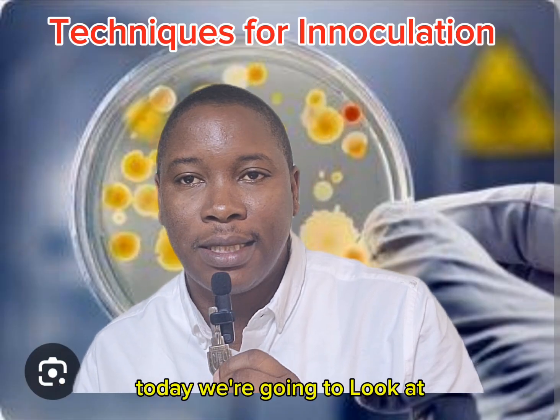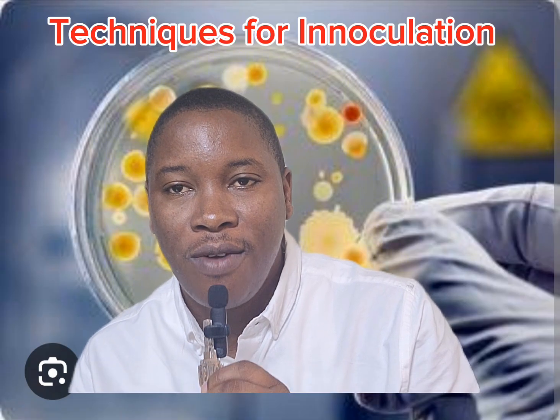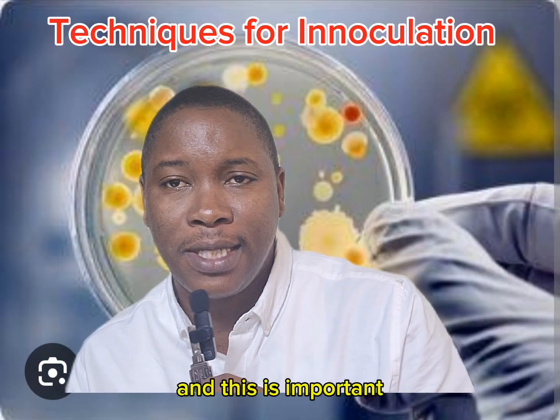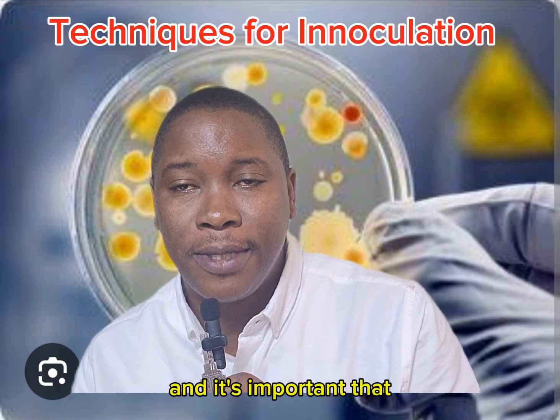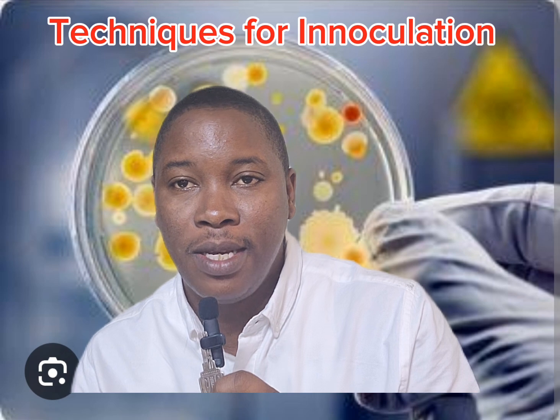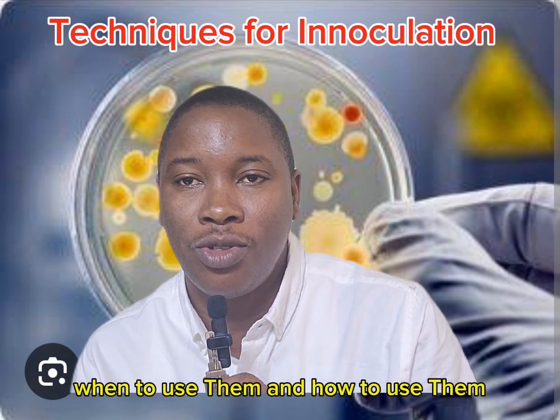Today, we are going to look at microbial techniques, techniques that are used for inoculation, and this is important. These are basic aspects of our microbiology and the kind of work we do in the laboratory. It's important that every student of microbiology and student of life sciences in general understands these techniques, when to use them and how to use them.